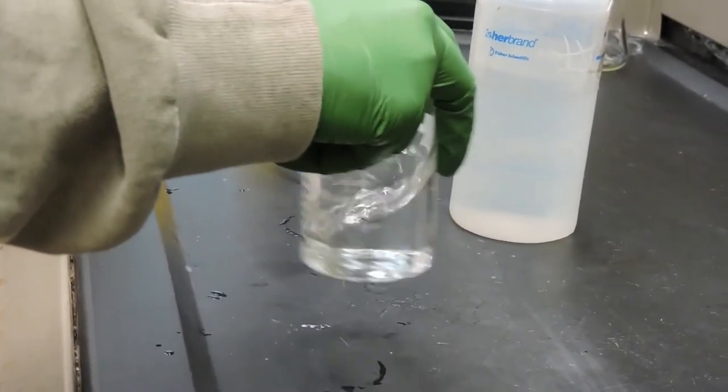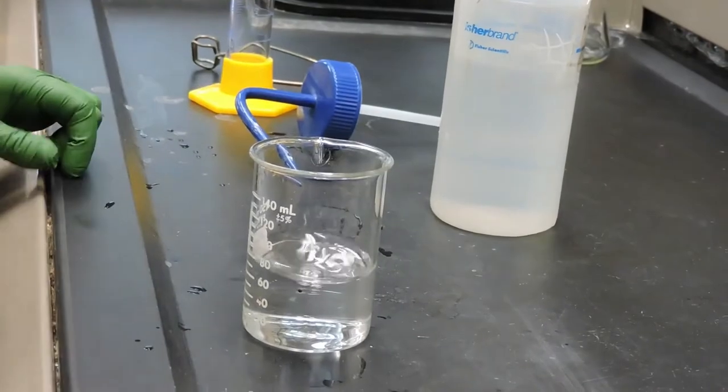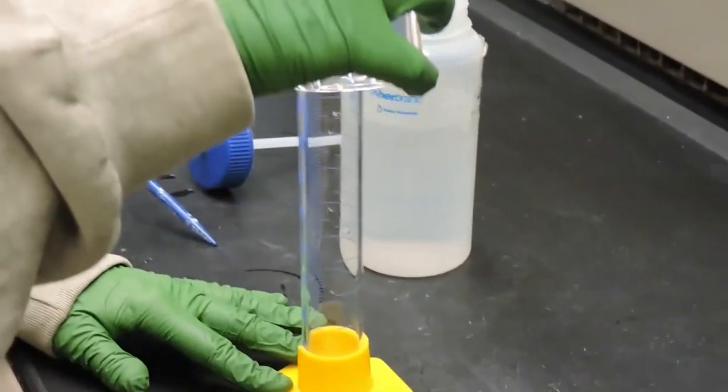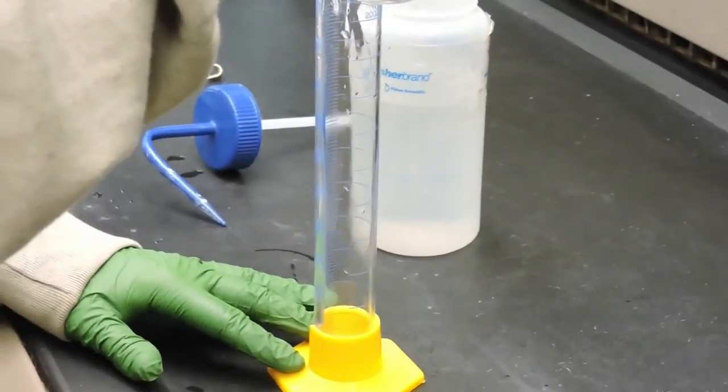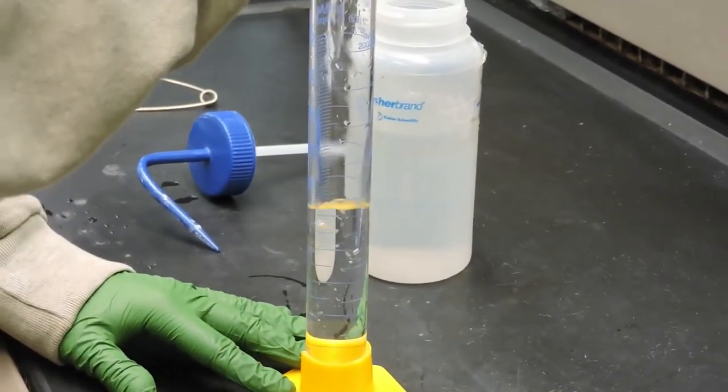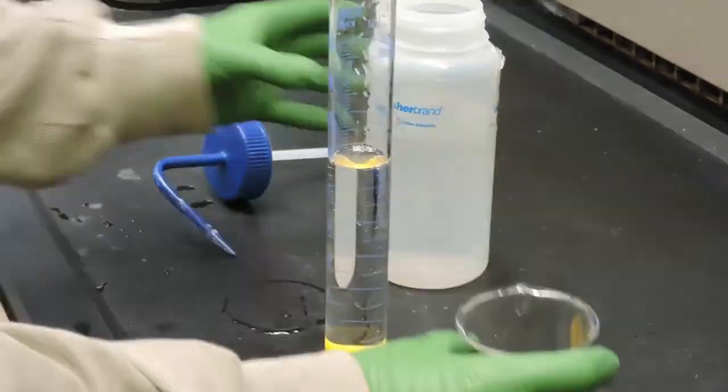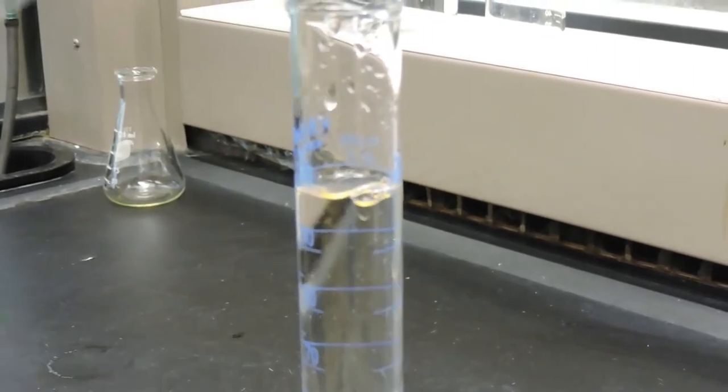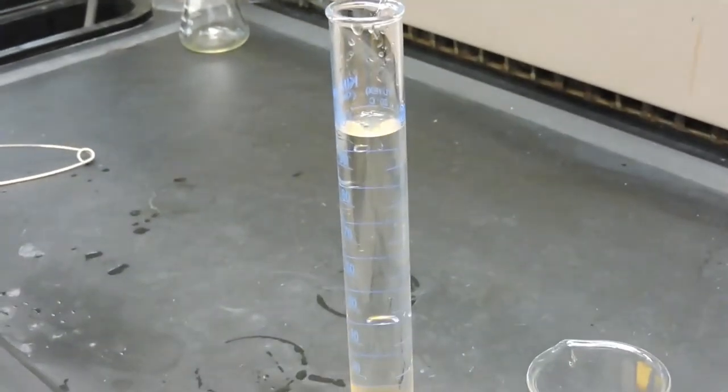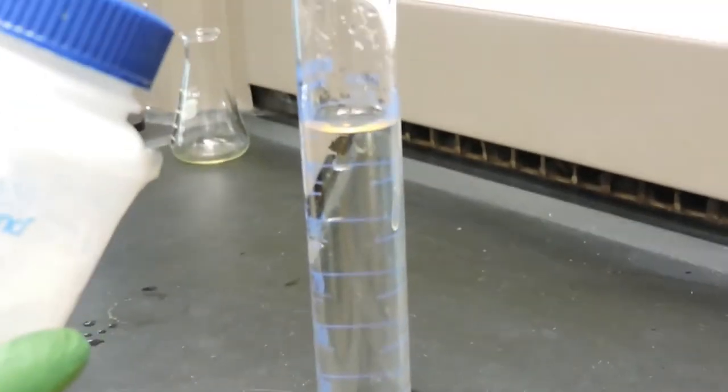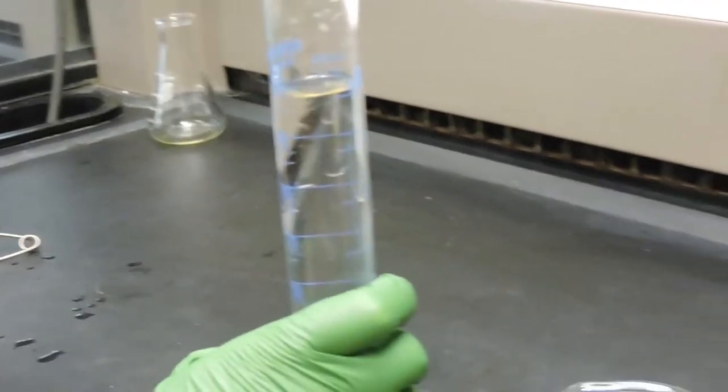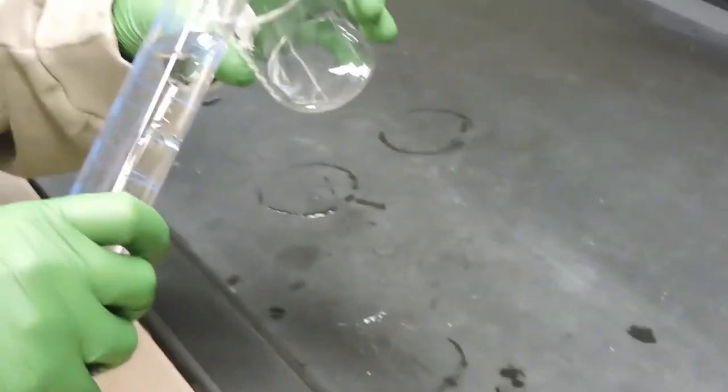Once the sugar is dissolved, we'll pour that sugar solution into a graduated cylinder and then bring the volume up to 100 milliliters. At 100 milliliters, we'll pour it back into the beaker.